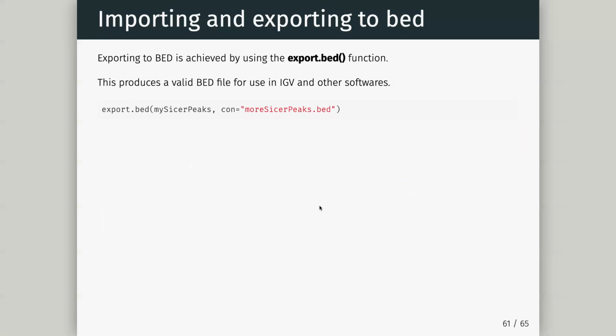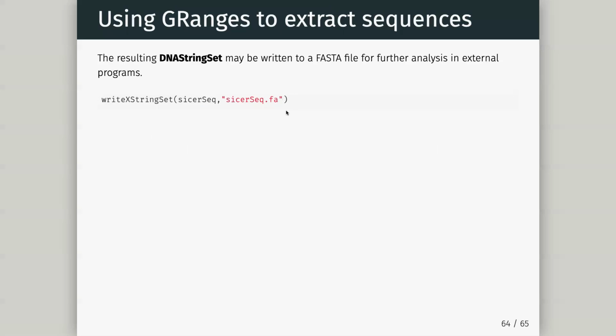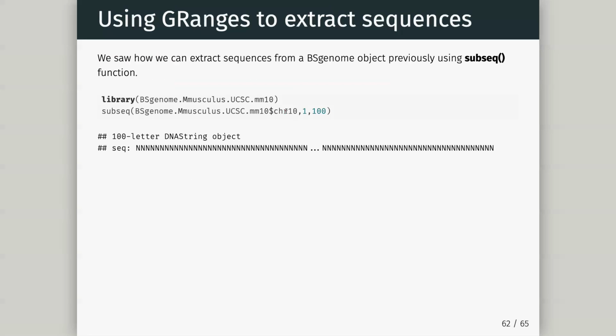If we want to export our GRanges after we've done our manipulations, which is one of the most useful things, just those ranges which overlap TSSs, maybe shifted our ranges up, we can write them out just by doing export.bed, giving it our GRanges, and then telling it the connection. Just to be difficult, export.bed doesn't use file or file path. It uses connection. That's really how you can import BED files, export BED files, and manipulate GRanges.